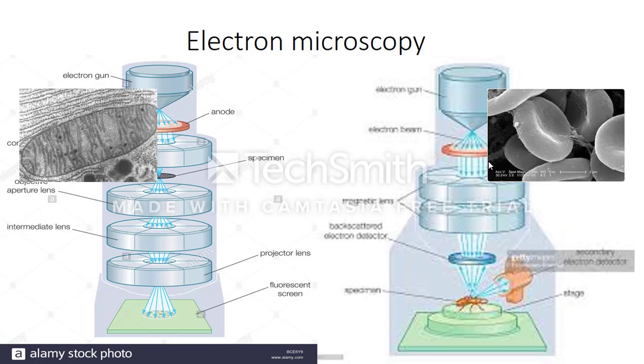Now, when we take images, the protein appears to be very dark because gold does not allow anything to pass through it. And this is simply because what does not pass through is dark in the microscope, and what does pass through is light in the microscope.